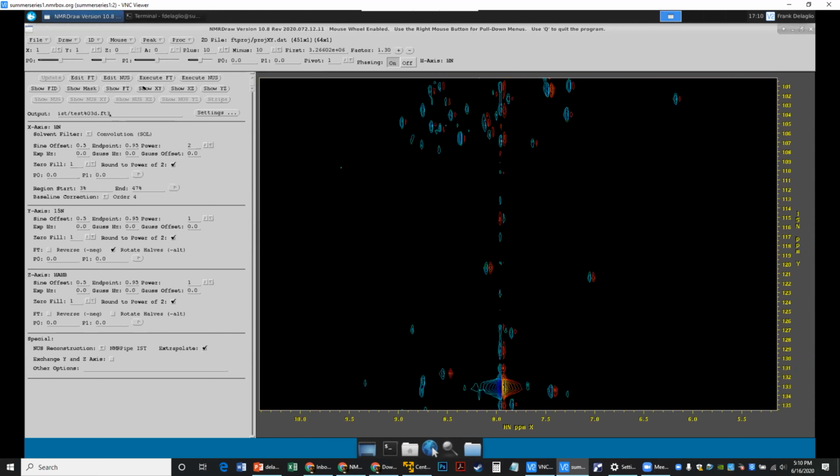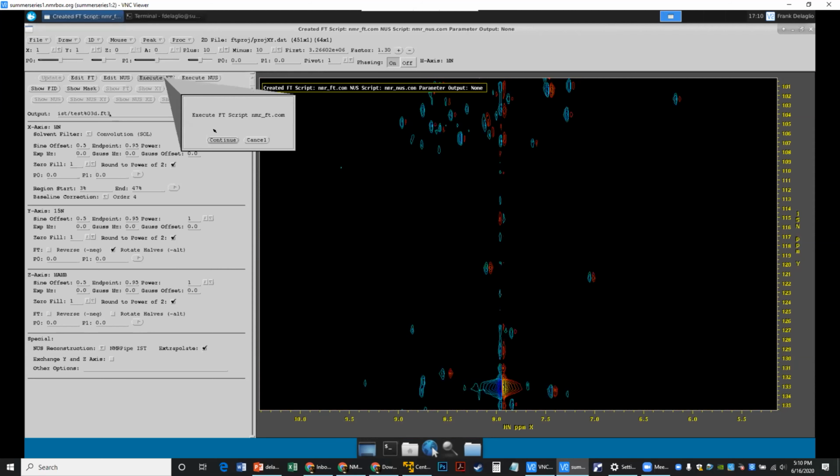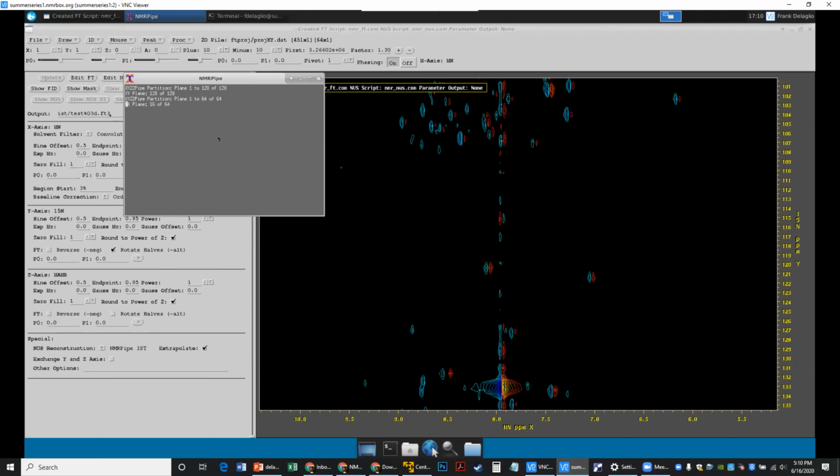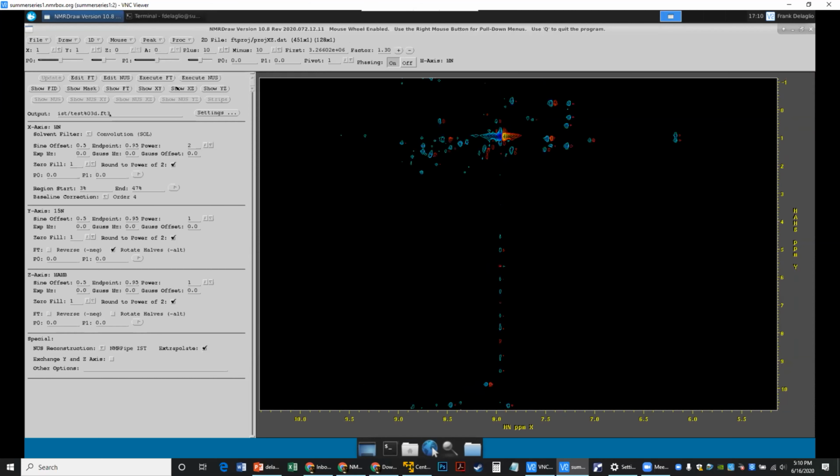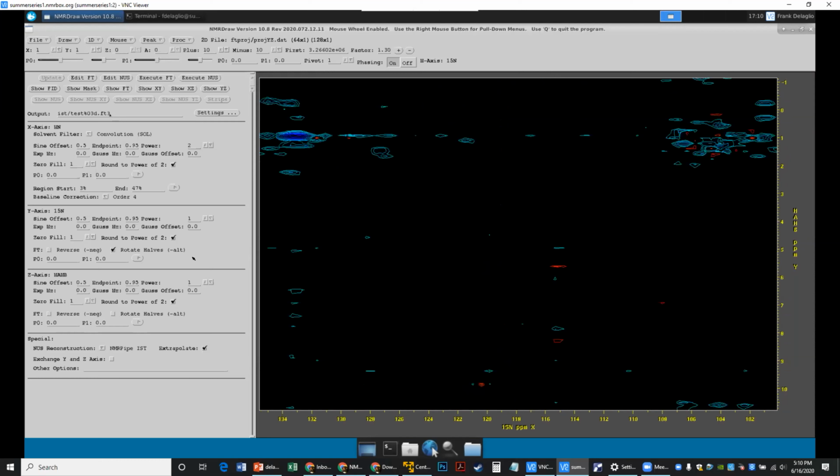And now if I look at the XY, what did I do? Frank, you rotated Y instead of Z. And isn't that what I want to do? They both need to be rotated. All right, let me start again.